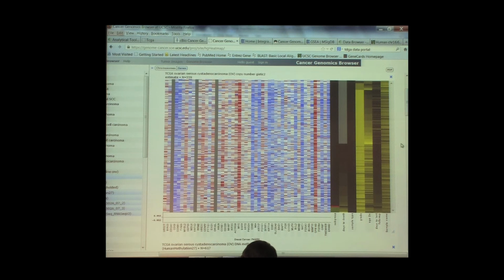I'm a little concerned here about the breakout on the subgroups, which tells me that I'm not going to be able to make a whole lot, because the way I've grouped these, for extremes on survival, I've now got the vast majority of my data in that intermediate range.